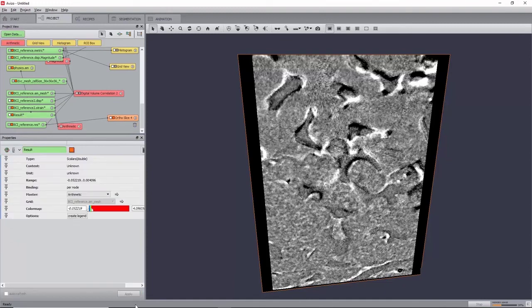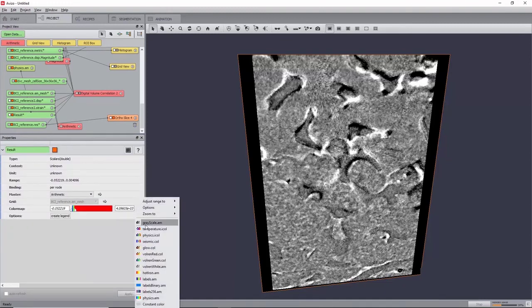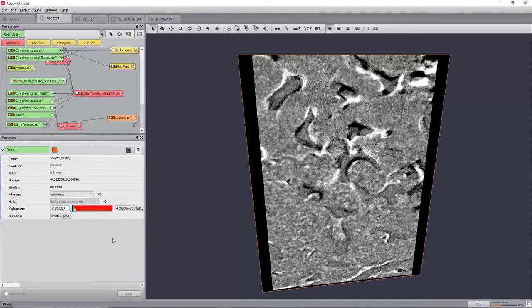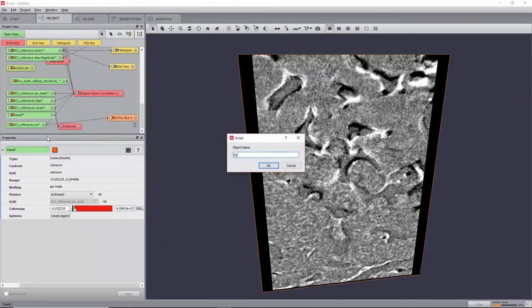This will create a new Scalar field. Set its color map to Physics, rename it to E33, and create a grid view on it.